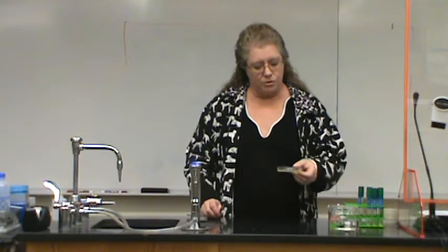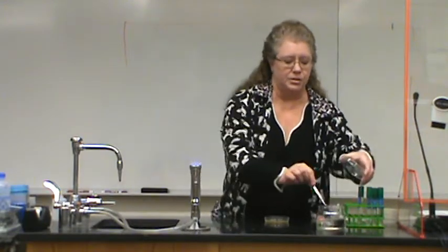But before you do that, you have to sterilize these forceps. So this is dry now. You want to leave this lid off as little as possible because you obviously don't want to contaminate your lawn of bacteria with bacteria floating around up here. And we're using it lid side up. So there's a very good chance of that. So first of all, sterilize your forceps by putting them in the alcohol. This is important. You put it in the alcohol first, then the flame.